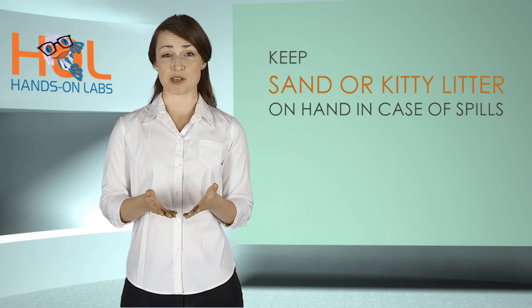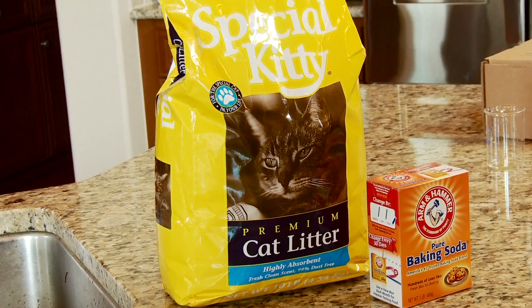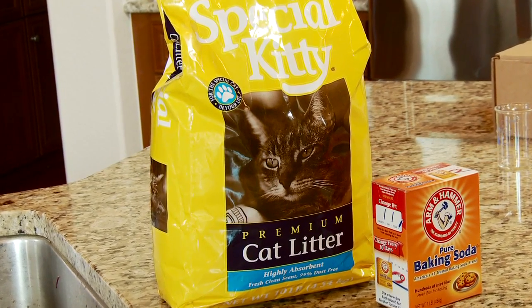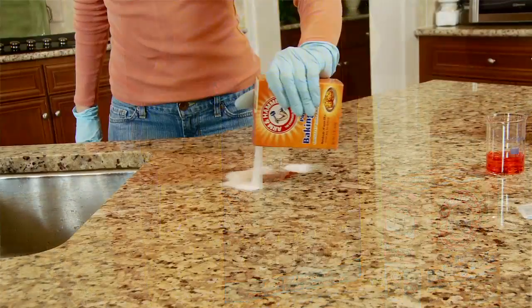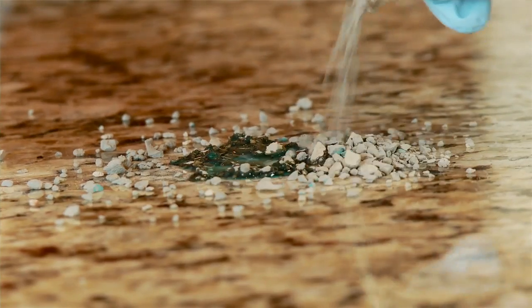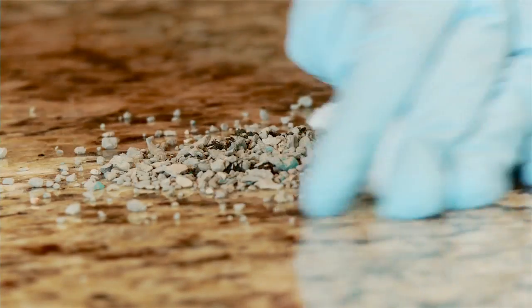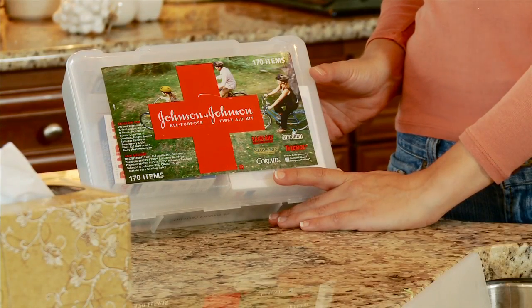For experiments using chemicals, keep a bag of sand or kitty litter on hand to absorb and contain any chemical spills. Keep sodium bicarbonate baking soda on hand to neutralize spilled acids before attempting to wipe them up. Concentrated acids can cause serious burns, so neutralize them before cleanup to help to prevent a painful injury. It's also a good idea to have a first aid kit handy.